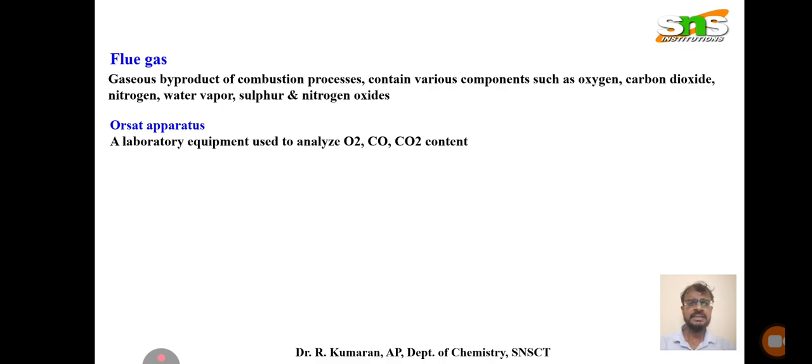So the Orsat apparatus is a versatile laboratory equipment, a very old technique, and it looks like a simple apparatus to analyze how much oxygen, carbon monoxide, and carbon dioxide content there is, and how it is separated from those and we get the inert gas in a pure form.